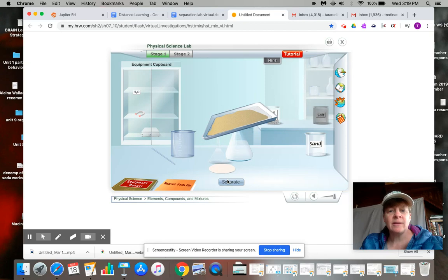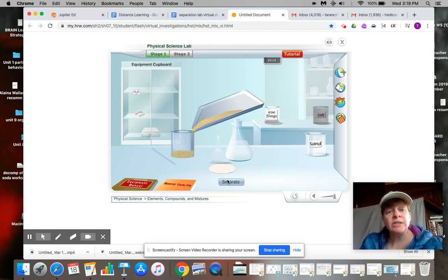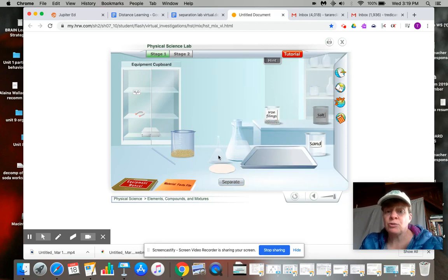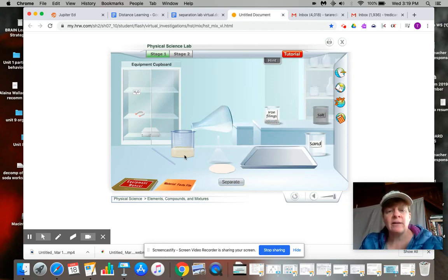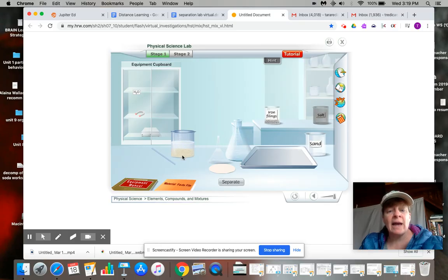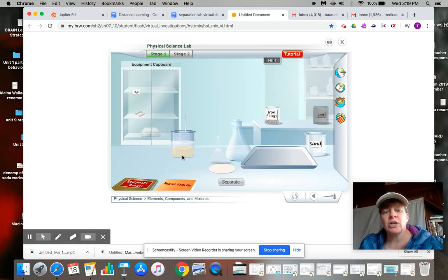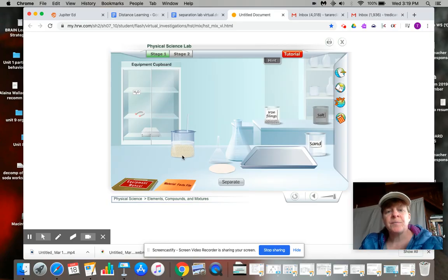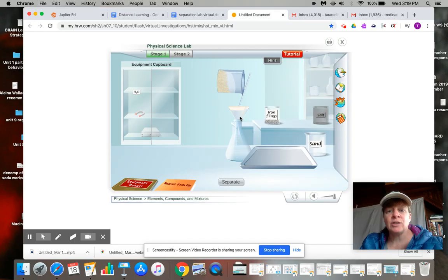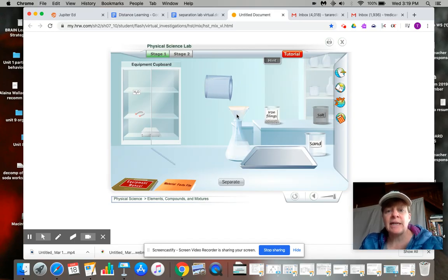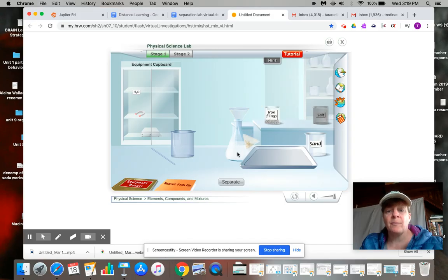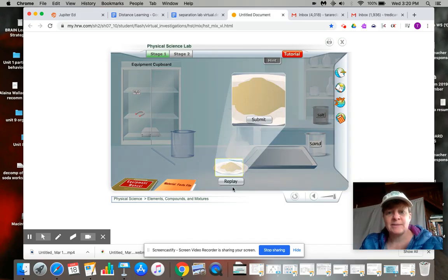So the salt and sand, that's two things in there. Now when adding the water, the salt is going to dissolve and stay in the water. And then the sand is going to get separated into the filter paper. So now you have sand here and salt water in the bottom of the flask. Okay, so we've got sand.